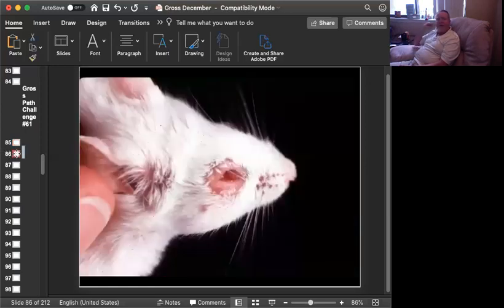Slide number 2 is tissue from a mouse. Can you give me a morphologic diagnosis? A likely cause, and I rarely ask this question, but can you give me an inbred strain of mouse that is susceptible to this condition?